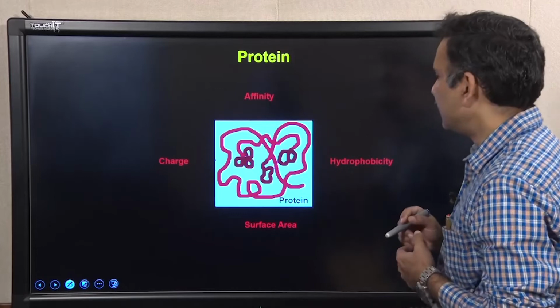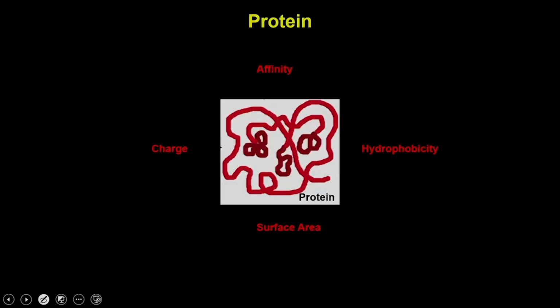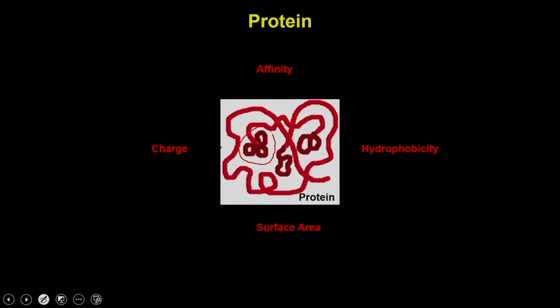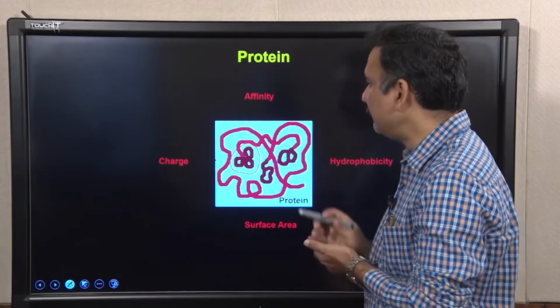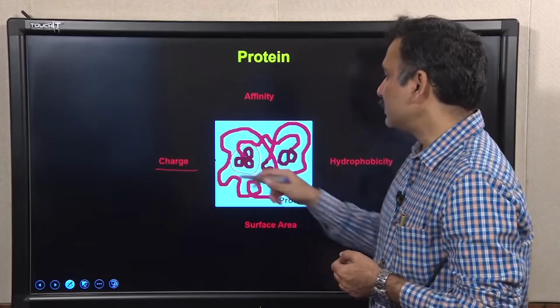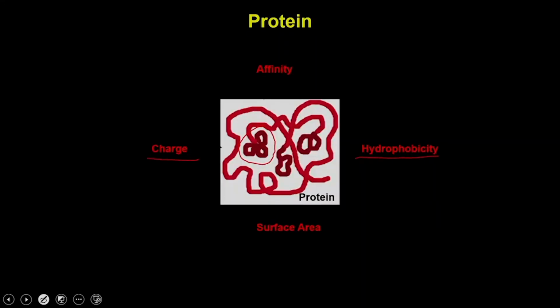So, let us see what these properties are. A properly folded protein secures its hydrophobic surfaces, or hydrophobic amino acid groups, inside the core, whereas it keeps charge on the surfaces. So you have two properties: the charge, which you can exploit, and the presence of these hydrophobic patches.